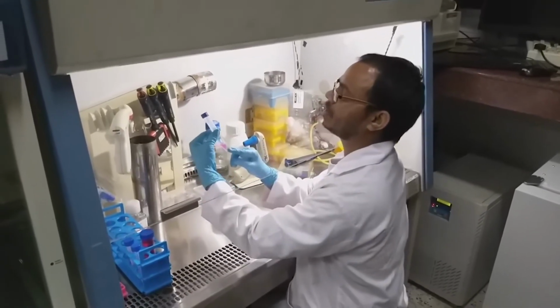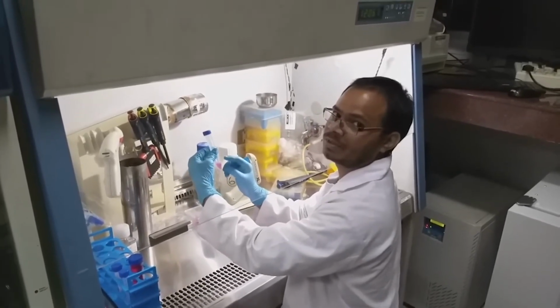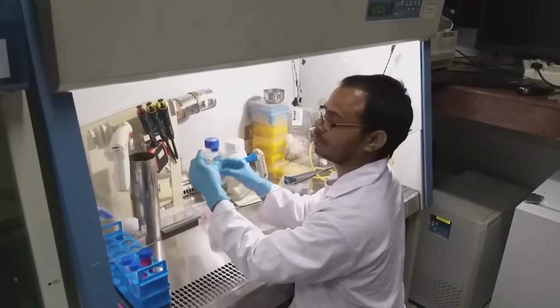So I am going to take 20 microliters of this cell suspension and mix it with 20 microliters of trypan blue and count under a Neubauer chamber.